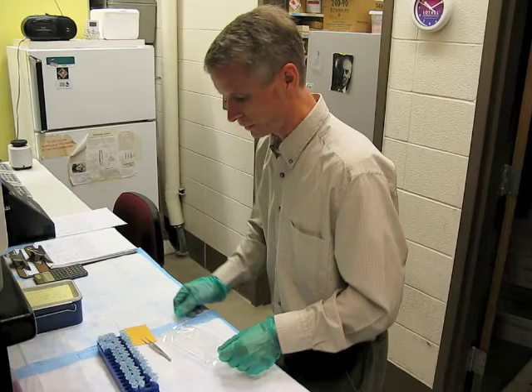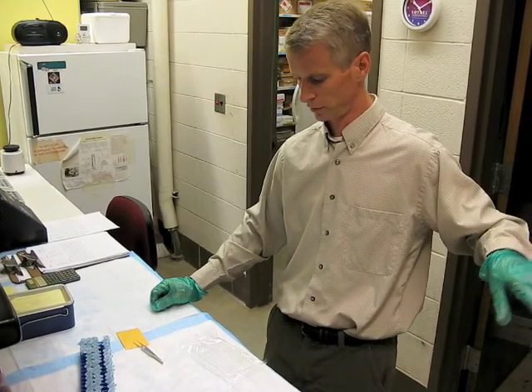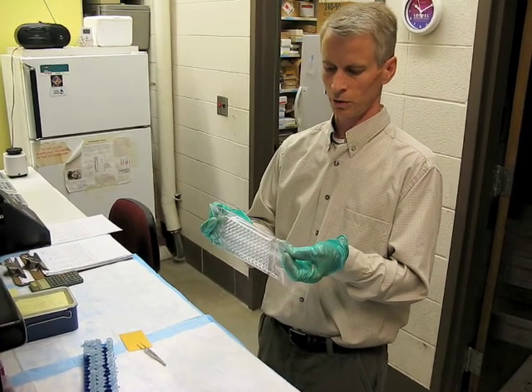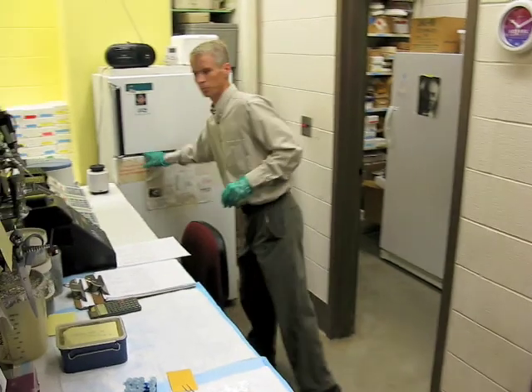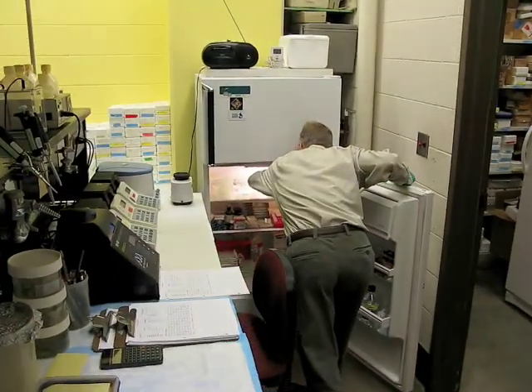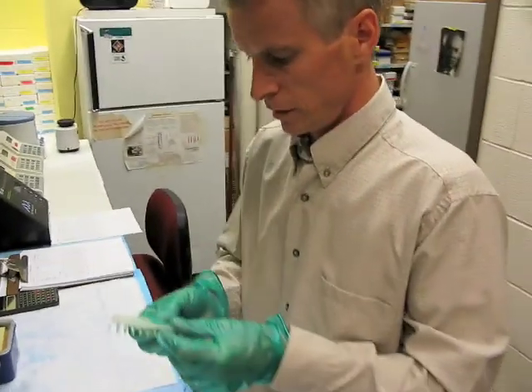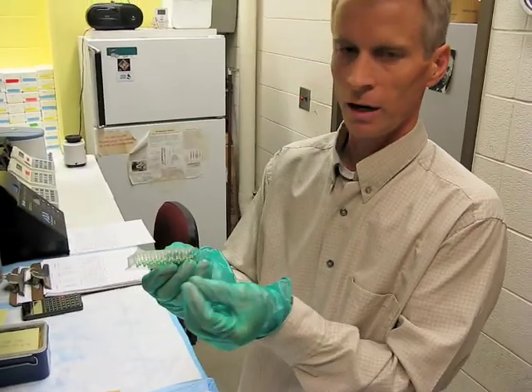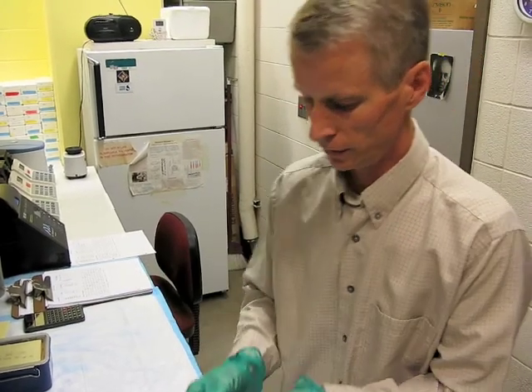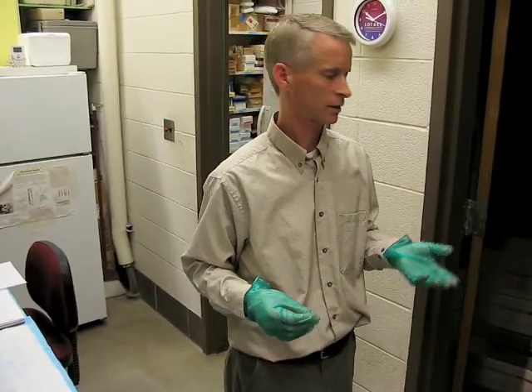The next step in the process would be to take a bunch of these samples. They've gone through the boiling procedure and we've spun them down. We use these 96-well plates that fill up with a little portion of the DNA — each little well would have a small amount of this solution containing DNA. The next step is to add that to what we call our master mix, or cocktail of ingredients.